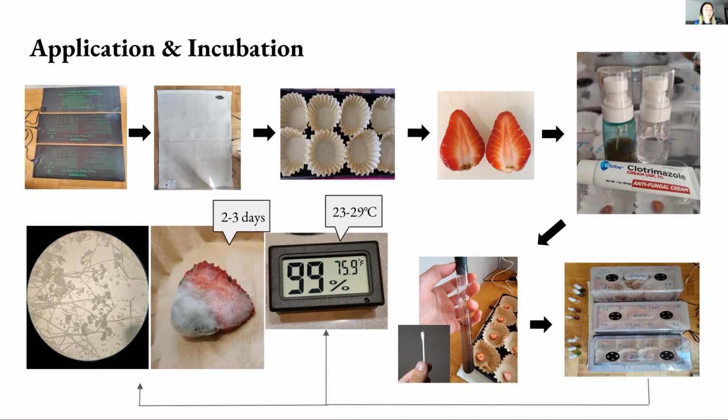strawberries in half and placed them on a coffee filter with the cut surface facing up. Then I sprayed 10 times, which is about 1 milliliter, with each respective solution. Because each pan fitted 8 coffee filters, I was able to test 2 different solutions 3 times in one dome, and using the 2 filters left for positive and negative control.